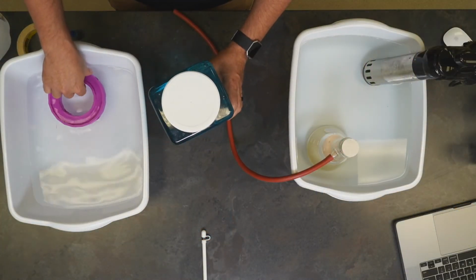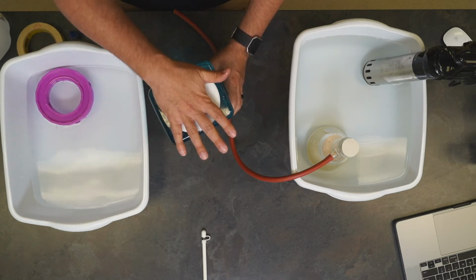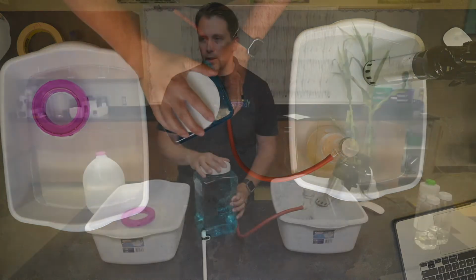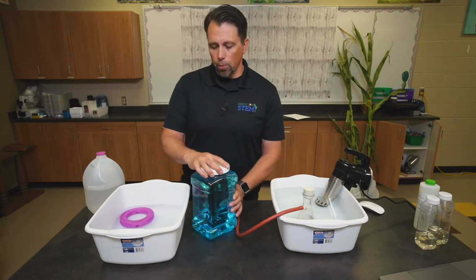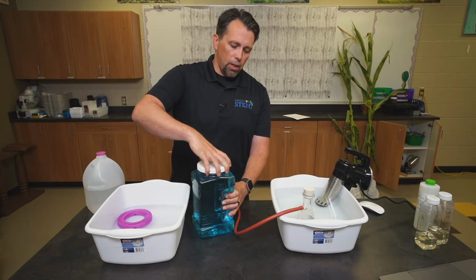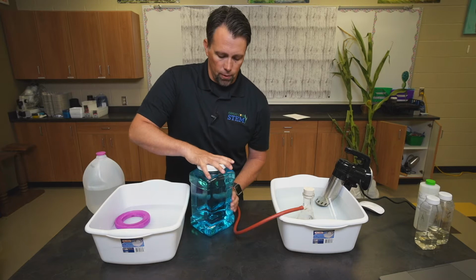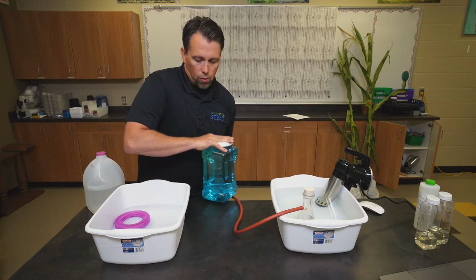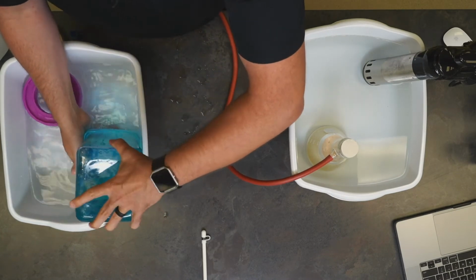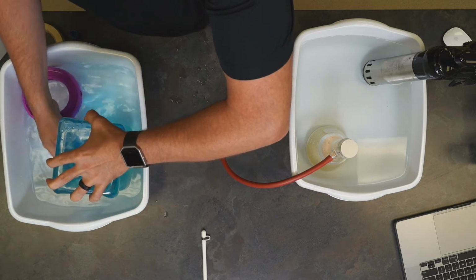You don't want a lot of water in this container. You want to make sure that it will hold the gallon of water in here. If you displace all of the water in this, it's going to end up in here, and if you have it too full, it will end up all over the floor. So what we're going to do is unscrew this a little bit just to make it easier when it's upside down, and then holding that on, going to flip it over into the water and try not to let any air in there. Get the lid all the way off.